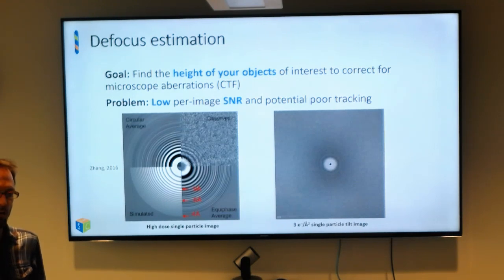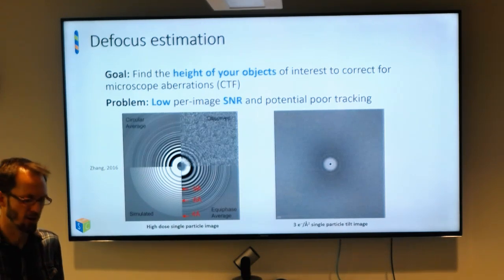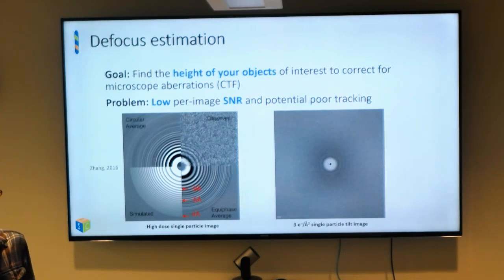Right. And with fiducials, you can align a tilt series and almost completely automate it, one button click in 5-10 minutes. Protomo takes some work depending on your sample. Yeah, yours has the hardest type of sample, and it does take extra work. But it's possible.